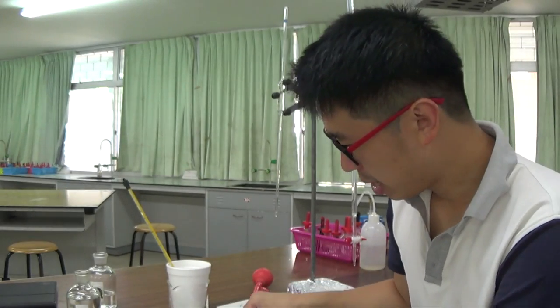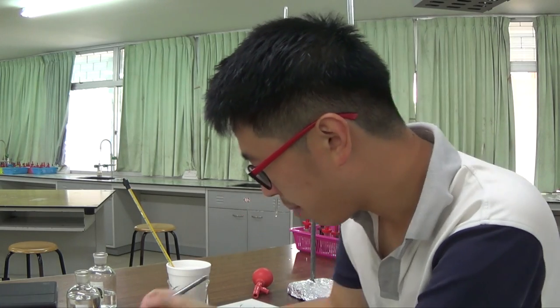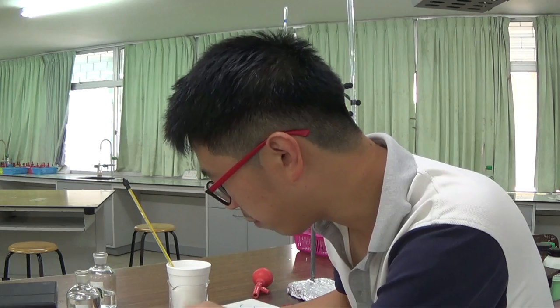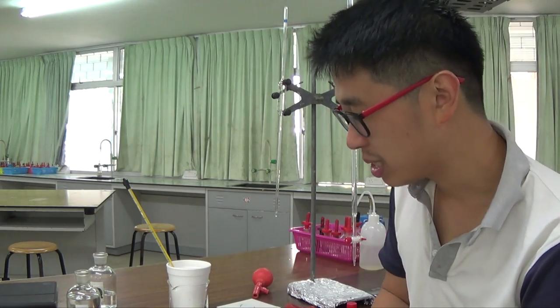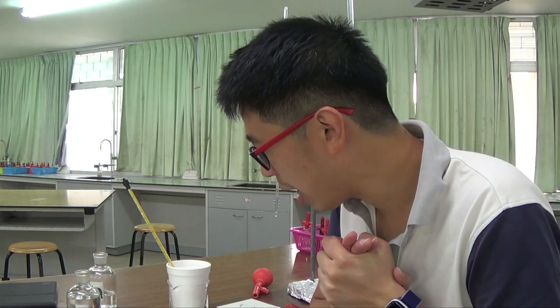So now, put Q in the burette, which I did, and measure 5.0 cm cubed of Q into a 25 cm cubed measuring cylinder. You do not insert this from the burette straight into here. You need a measuring cylinder, which I am going to go and get now, because I didn't think to read beforehand, so I didn't have my measuring cylinder. I'll be back in a minute.